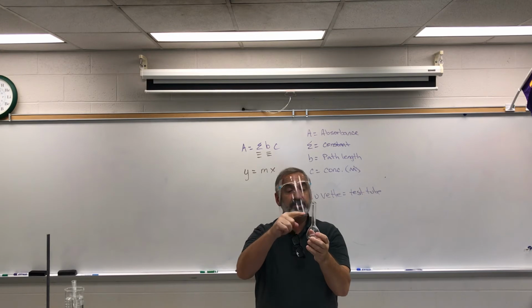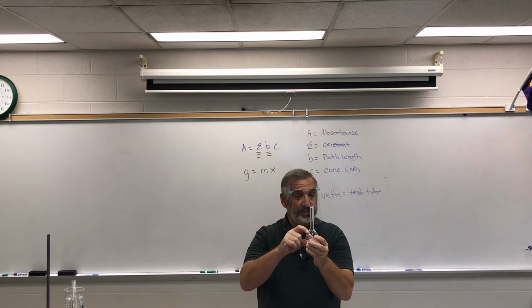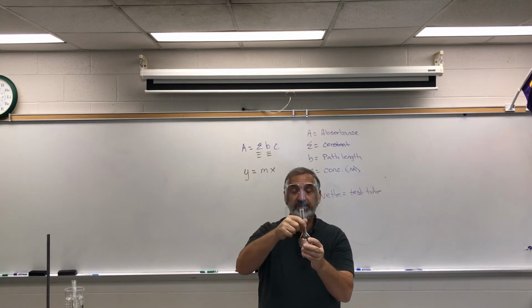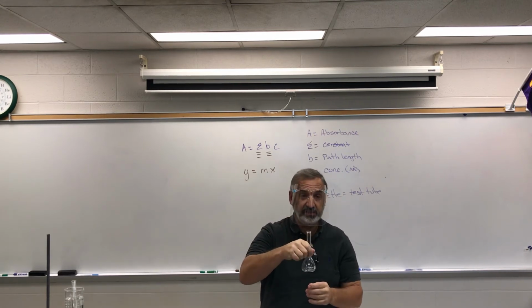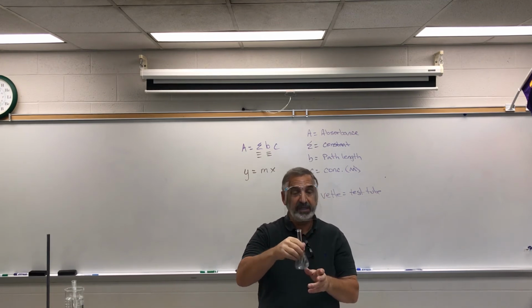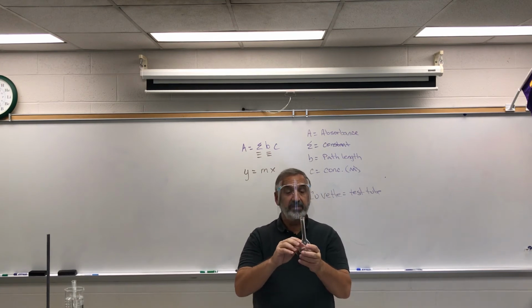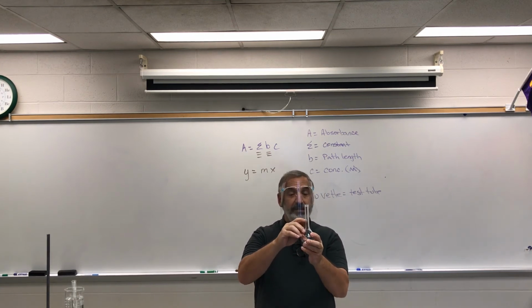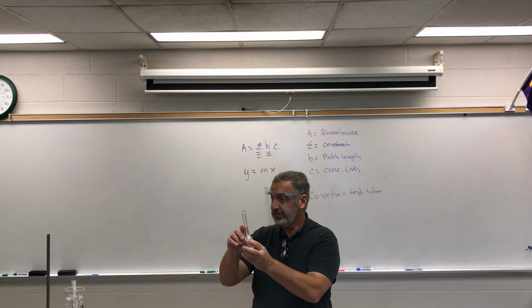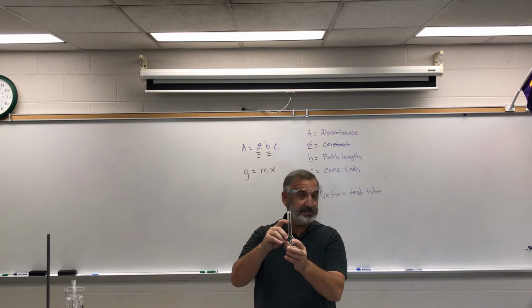So we're going to measure our solid down into here. Fill it about 2/3 full with distilled water. You don't want to fill it all the way full because you want to have room to shake it. Okay? And we have lids that you can put on top of it as well. So you shake it up and get it all dissolved at 2/3. Then you add the water to where the bottom of the meniscus is just on the top of the line. Okay, and you add slowly, because if you go past, there's no going back. You start all over again.